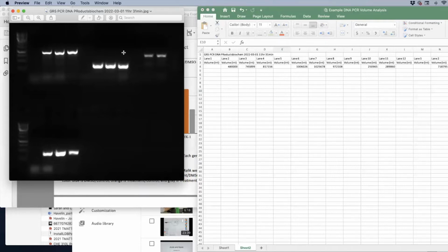And so what is this, 4, 8, 10? So like over here, lane 10 is 250. Like it's saying this is basically about half as bright as this guy. So the numbers correlate with the brightness of the bands. And then for basically everyone except the one group who only has one set of wells, you guys have this restart over here where it's going to say like lane 1, lane 2, lane 3, 4 after lane 12. That's the data from down here. Okay.